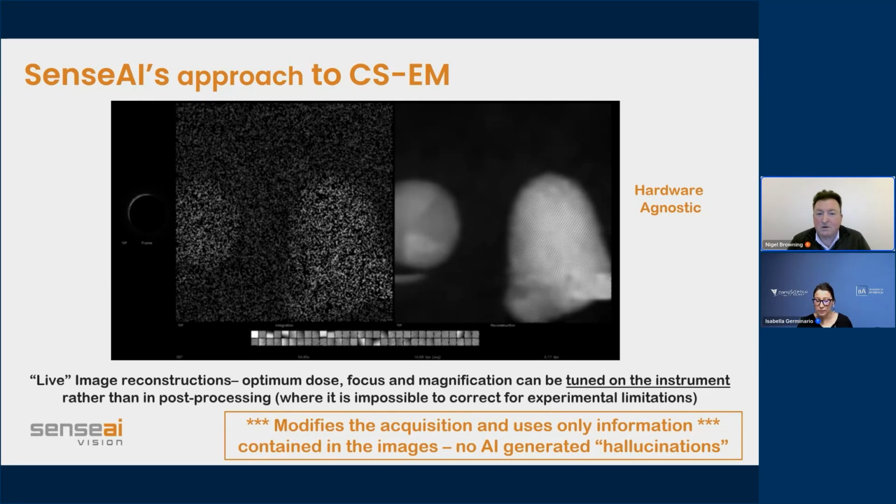but if you look at the one that's on the screen, you can see that that's not a random walk pattern for the 4D STEM. And the reason for that is because when you stop to acquire your 4D STEM pattern, we have to stop for longer to get enough signal. Even with a very good detector, you're talking about 50 microseconds instead of 5 microseconds. At that point, it will stabilize, and then you can do a more random scan to go through that process. And that works well for the conditions where you have a longer dwell time where you're trying to go through that process.